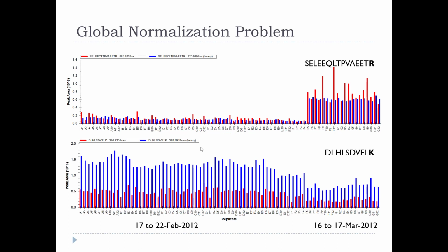And this peptide actually goes the other way. Sometimes we use global normalization, like while we're here, we're going to be using maybe median normalization. We use some normalization that we apply to everything, because in a lot of cases similar things are happening to a lot of our analytes, but it's not as good as having a heavy labeled peptide where we've already done method development and we know that it acts similarly.